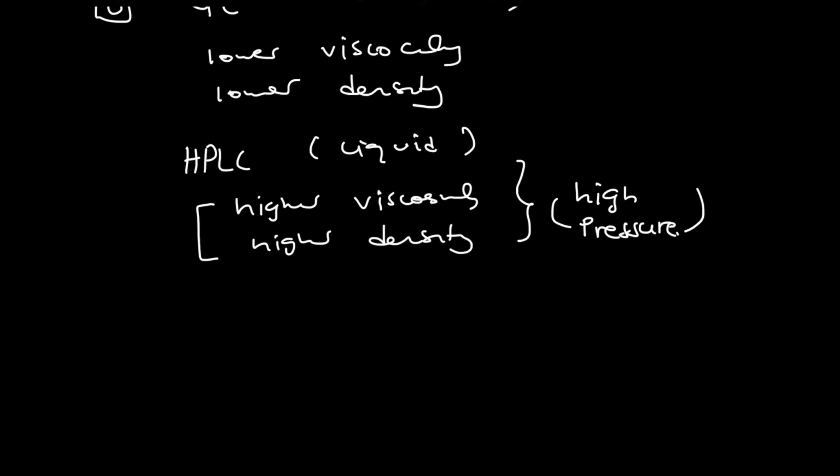Another thing I can mention, which is quite important: because in GC we are using a gaseous mobile phase, there is going to be a fast diffusion.